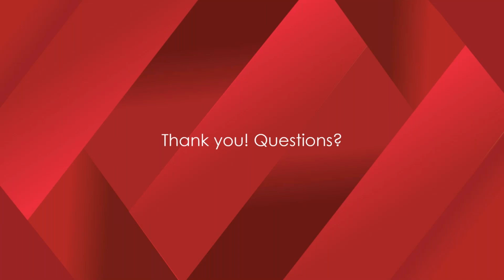Okay, this next question is, after a method change request is submitted, before the request is approved, can the unchanged method still be used to perform a test? Can another user still use the unchanged method version? So if you have a method that's been changed and submitted for review, that method cannot be used by any other user. So in my example, Sally made a change to her method. She submitted it for review, and then she tried to test with it, and she couldn't test with it. So even if Sam went in and tried to test with that method, or Newt, they would get blocked because that method has not been approved, and you cannot test with that method until it's been approved.